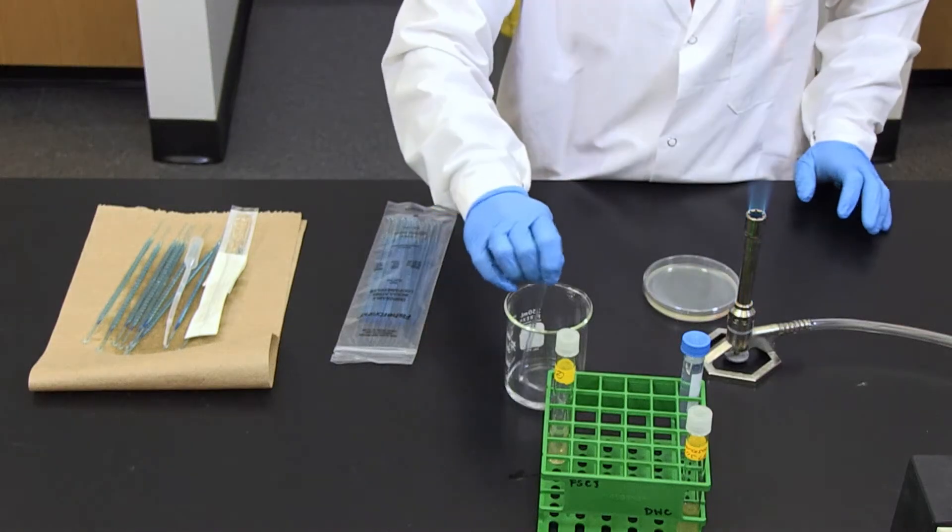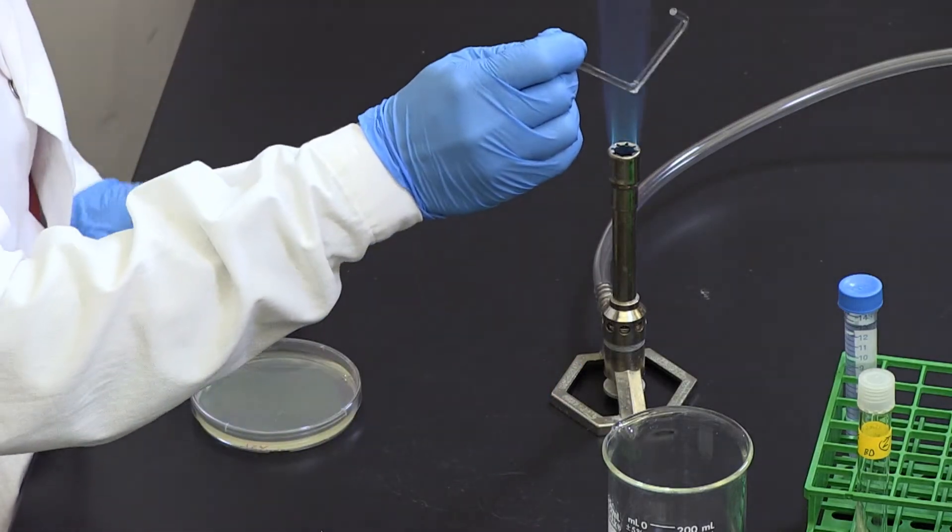Immerse the cell spreader in the ethanol beaker and re-sterilize it.